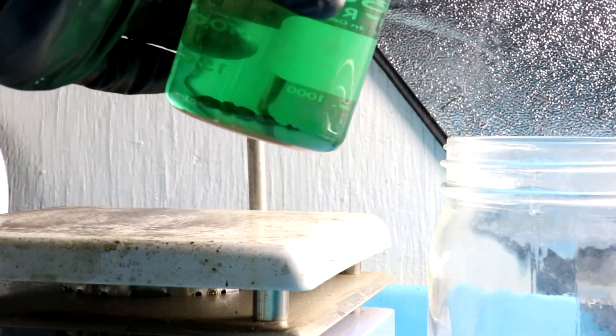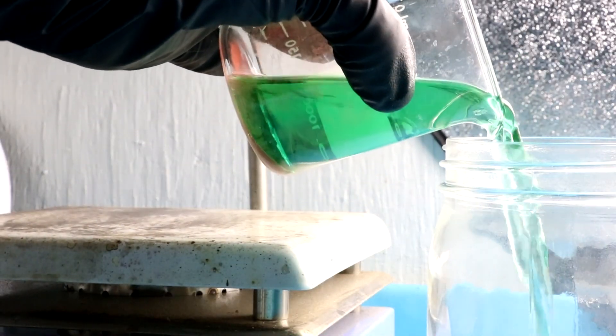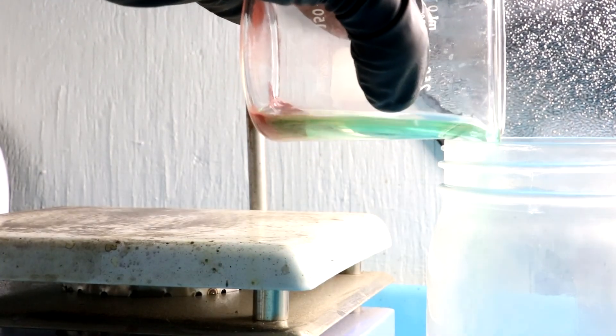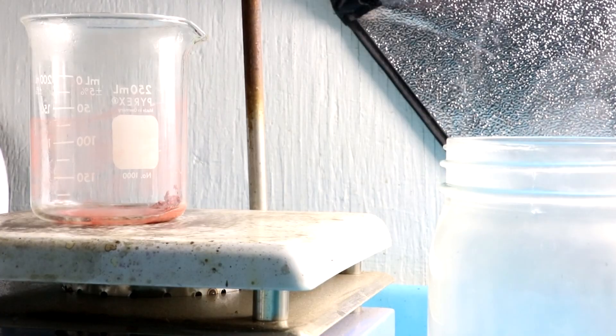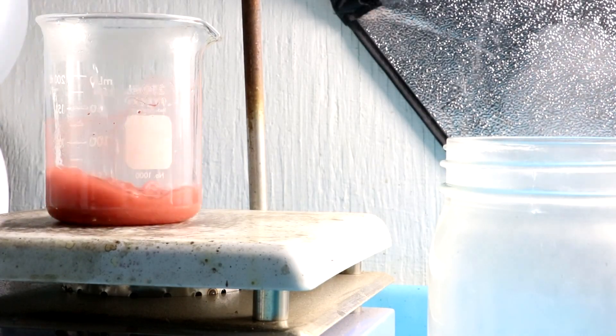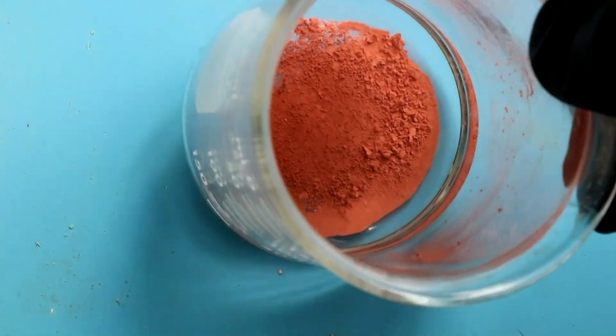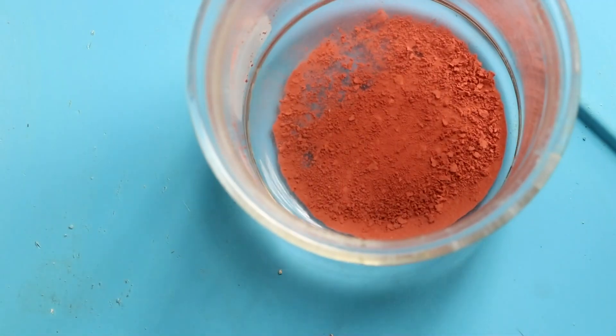So now I'm going to decant the remaining solution just so that we can see through it a little bit easier. Maybe wash it with a little bit of water. So now that we can see the copper a little bit better I'm going to add the mercury.